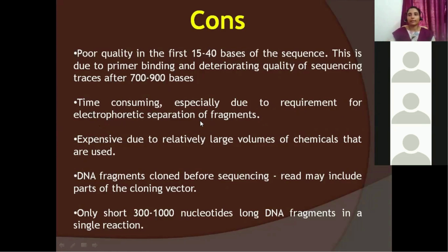Electrophoresis takes some time. Then it is expensive due to the relatively large volume of chemicals that are used. So many chemicals are used, it is expensive. Okay, so that's it, I guess.